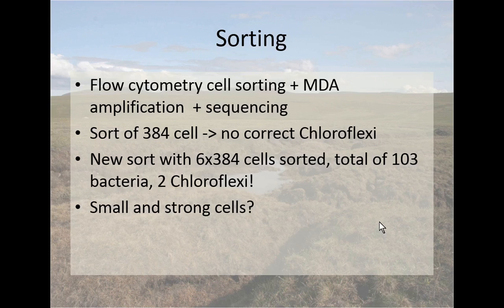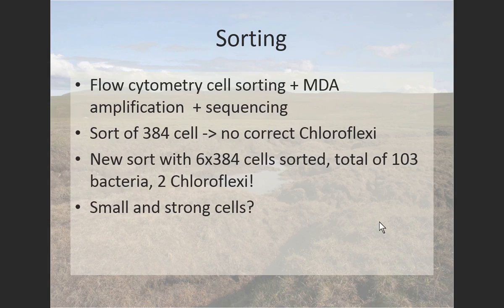And they can be really, really strong because they've been surviving in those frozen conditions for tens of thousands of years. So just some cell disruption doesn't really destroy them, clearly, but we would need something stronger to get those cells broken.